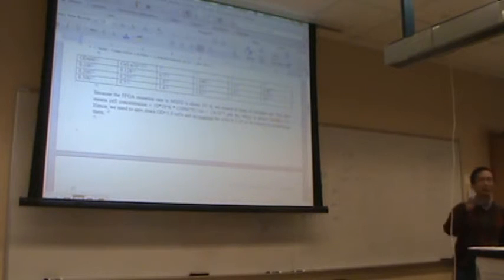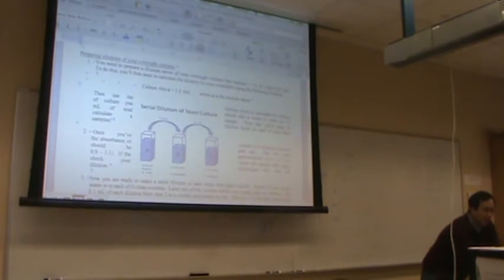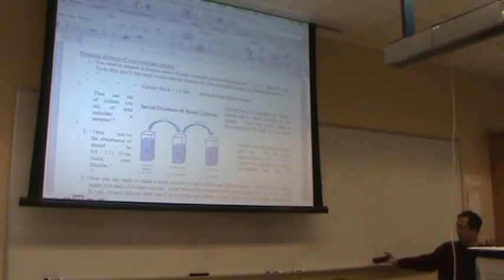There's a mutation frequency, and in fact you can calculate the mutation frequency, and then from the OD value estimate how many cells we need. Serial dilution, and then we just perform serial dilution. So you already did the absorbance? Yeah, the OD spectrometer value. On our page, it says FOA protocol. So I've given you enough cells to see some mutations.